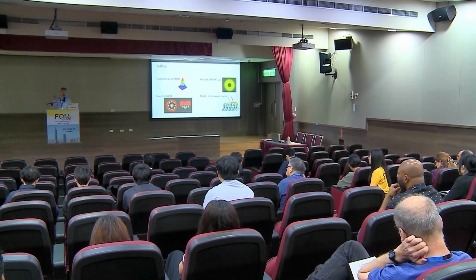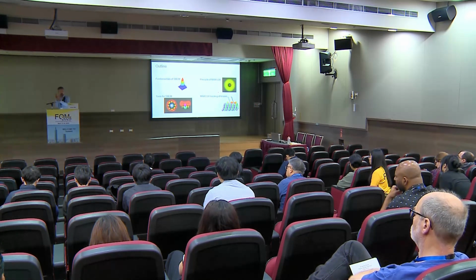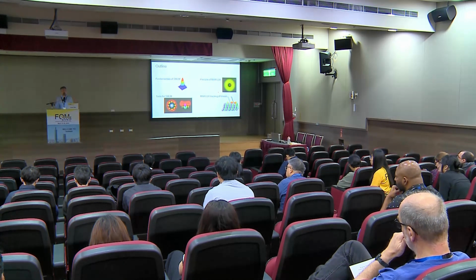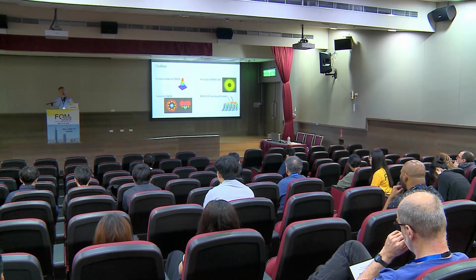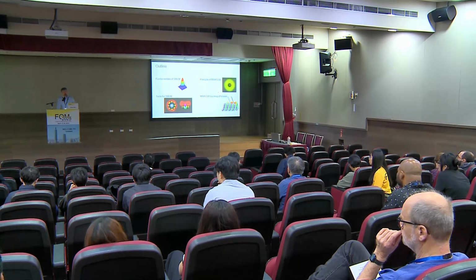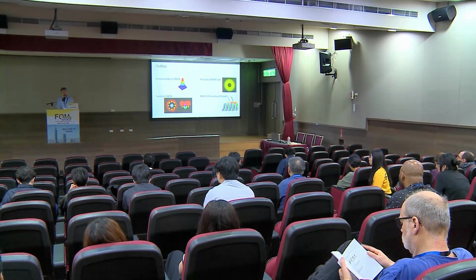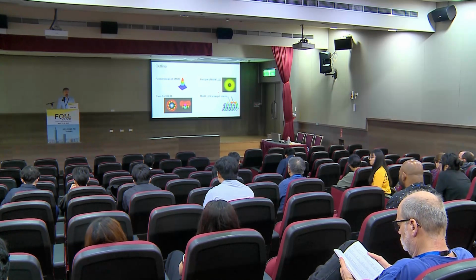And since MINFLUX needs a small displacement between two localizations so that we can still follow it, a displacement smaller than the scan pattern size, if you have very fast diffusion, then maybe camera-based tracking is better, because even if it jumps by a micrometer, we do not necessarily lose our single fluorophore. Although then we also get, of course, motion artifacts at some point. But when we are safely below this maximum diffusion, then MINFLUX can actually perform very well. And it's good if you want to have a high precision and long track lengths, not so much if you want to look at very fast diffusion. Thank you.